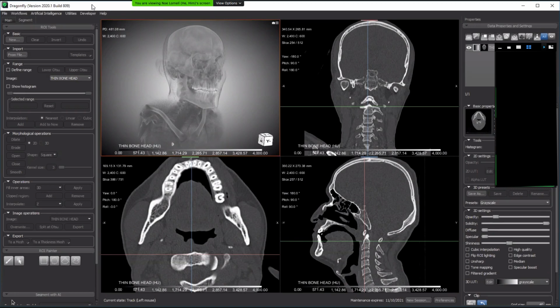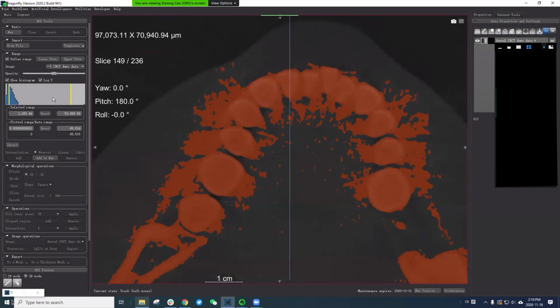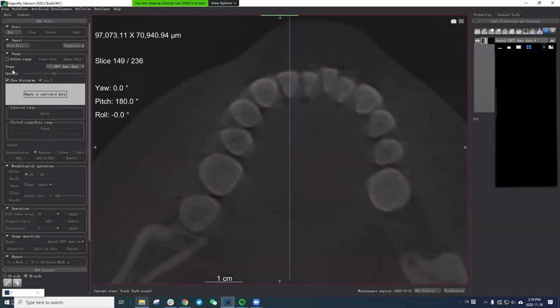So I'm going back to my screen. I'm showing the workflow of how to do this. To use the deep learning tools, we have an extra step to do, which is the preparation of the data set. It's a normalization.